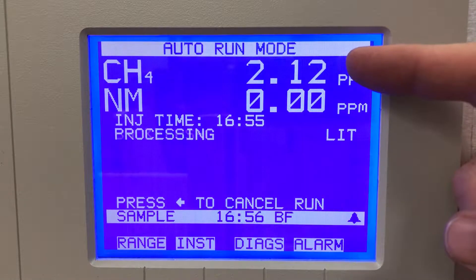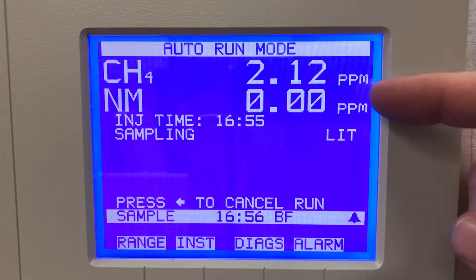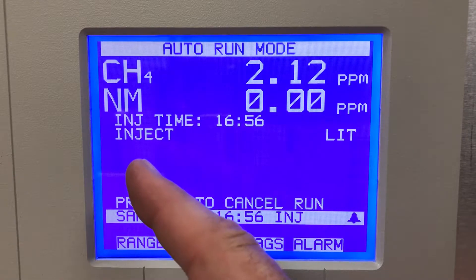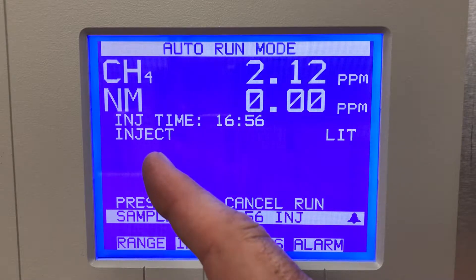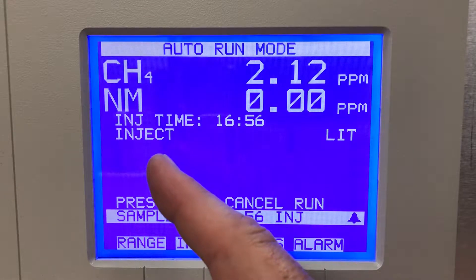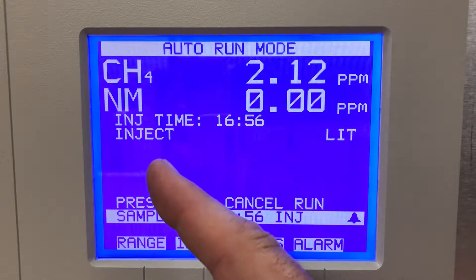We're showing 2.12 ppm on the methane channel and the non-methane channel is reading zero. We're just sampling room air right now and you can see these words changing every few seconds. It's on the inject mode — it will tell you what mode it's in as it's operating, so it's injecting the sample into the column.